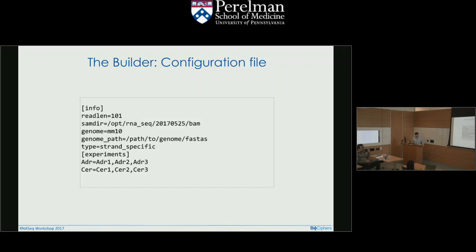You want to build everything together. So conceptually, the reason to do this separated like this is you have one builder that will identify all the variations across all your samples, so they all speak the same language, right? Because there's a lot of de novo stuff that is not necessarily annotated, and you want to make sure all the LSVs that you detect in all the samples are talking about the same LSVs. So this is why you do the builder once, and you do it with all your samples. And then, once you've done it once, you can do many different psi and delta psi quantifications for various groups or various analyses that you're interested in. So that's the logic behind those constraints.